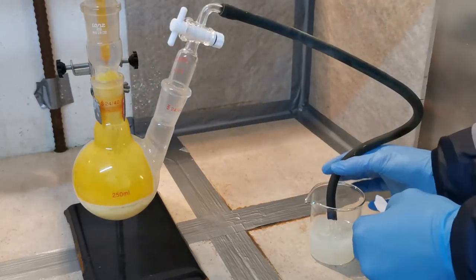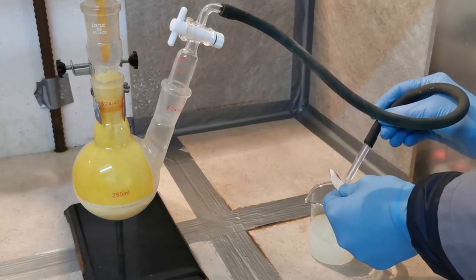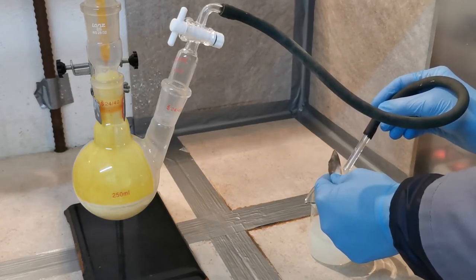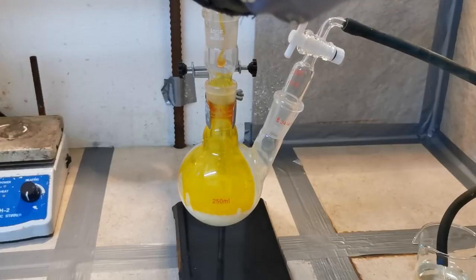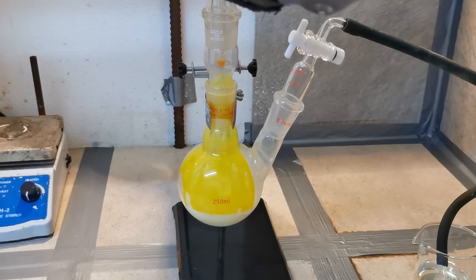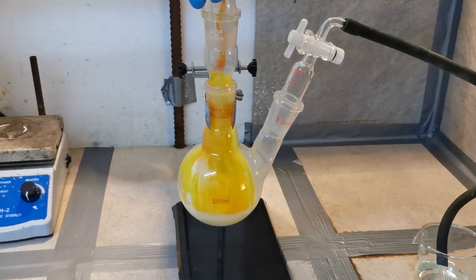This process is very easy to control, because the liquids react instantly. However, it isn't the most efficient, since some elemental sulfur is also produced in the reaction. Keeping the ratio of sulfur small reduces this byproduct, but more HCl is needed to neutralize the hydroxide. So depending on what is more important in your circumstance, just change the ratio accordingly.